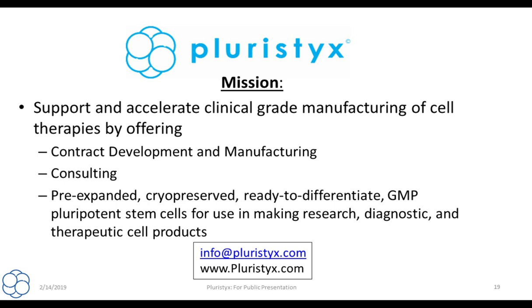So I guess when you get into final or actual phase 1 manufacturing for patients, everything, soup to nuts, has to be done in a GMP environment. But if you're making material for pre-IND enabling studies, preclinical and animal studies, that has to start from a GMP master cell bank, but you could make it under GLP in a less clean or less controlled environment for IND enabling studies.